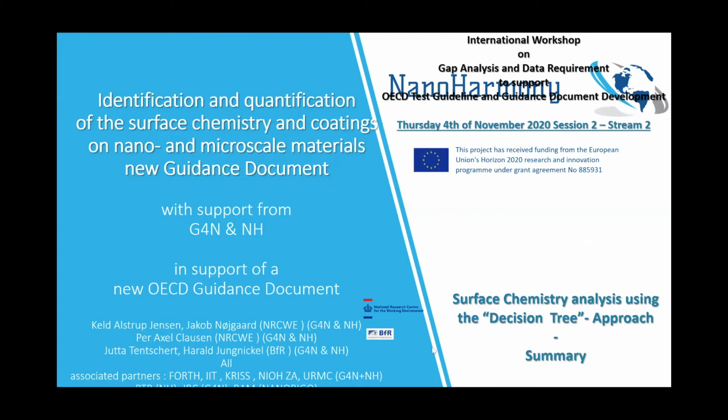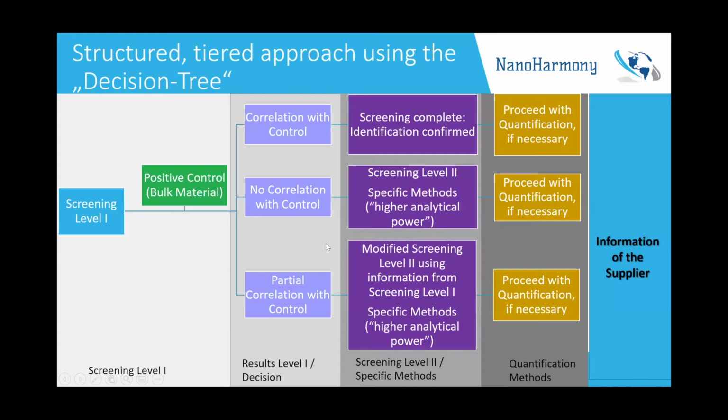Here I start with the summary for the surface chemistry analysis and using the decision tree approach. So we are working on that structured decision tree approach. It's a tiered approach to analyze, identify and quantify the surface chemistry.